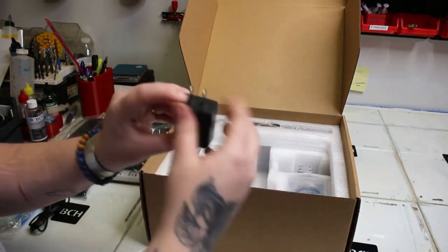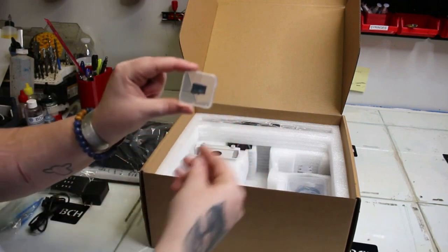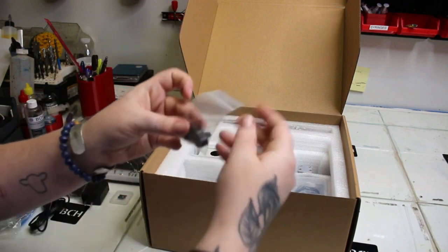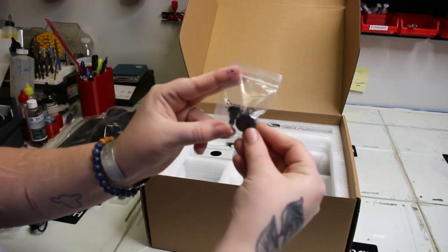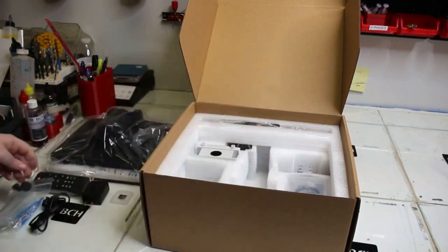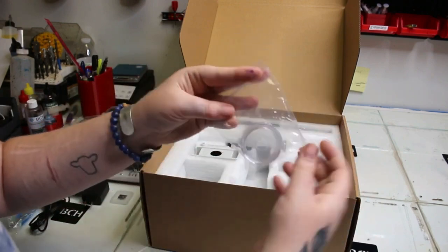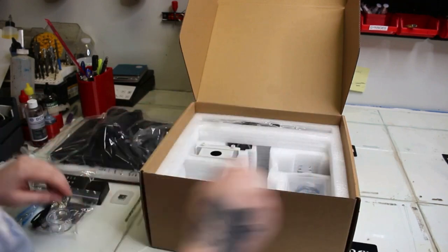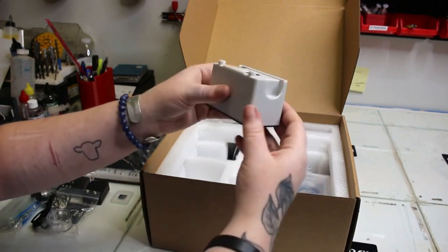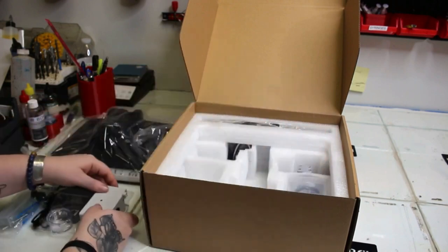Here is a USB cable included in the box. We're also included with a power supply to power on the microscope, an SD card to record anything that we look at under the microscope, and it is labeled spare parts on this baggie for a few screws used in putting together the microscope. We're also included with a clear bug viewing case — if you catch any bugs and want to experiment or look at them, you can put them in there. We're also given a really cool light box, and I'll show you how to use that later in the video with the third lens.